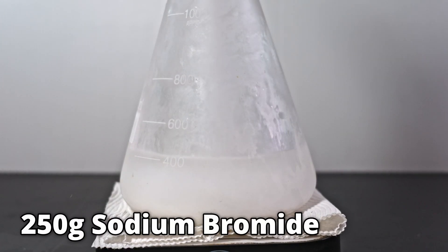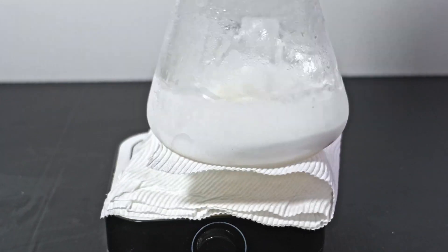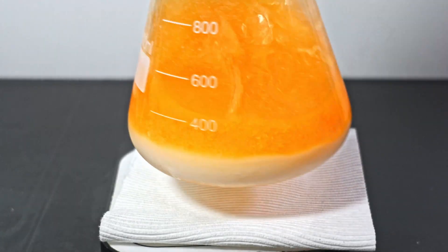I add the final 250 grams of sodium bromide and begin the dripping. Again, I have to manually stir because of the duration of the addition.